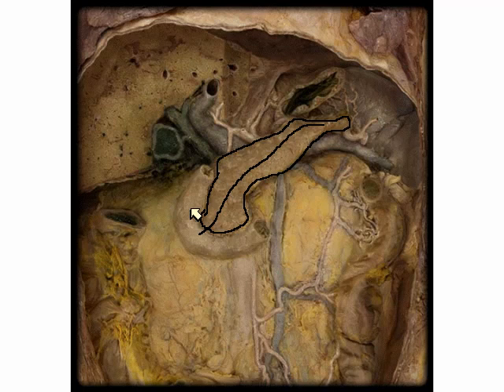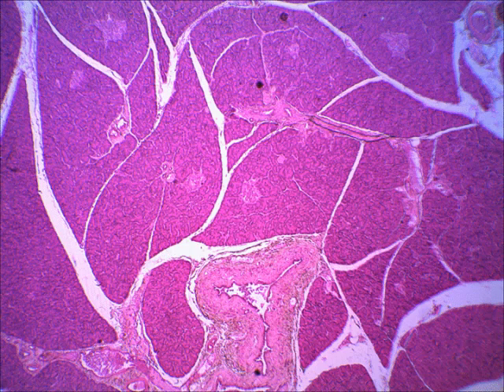So this organ right here, this is the very first part of your small intestine. Pancreatic juice empties into that to aid with digestion. But in this lab exercise, we're going to look at the pancreas as an endocrine gland, not exocrine. All right, and so we've got to look at it through the microscope.